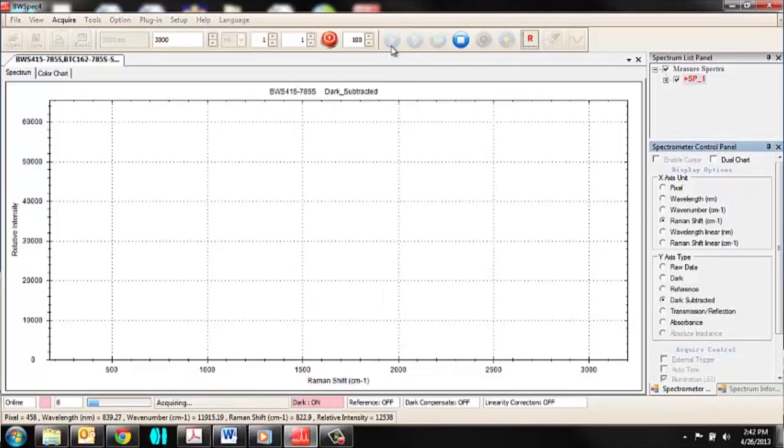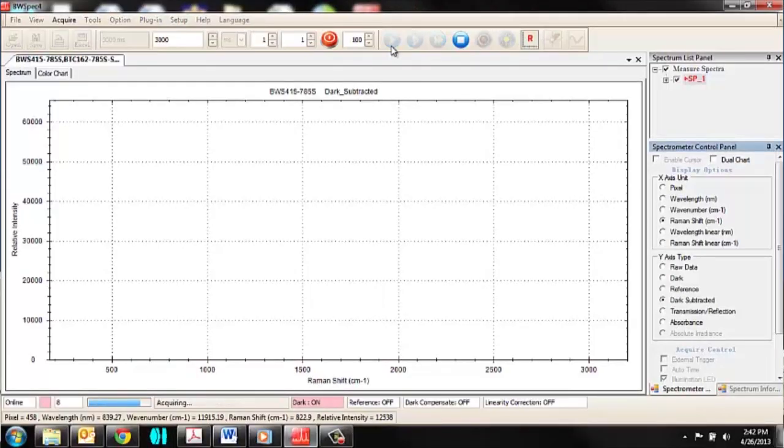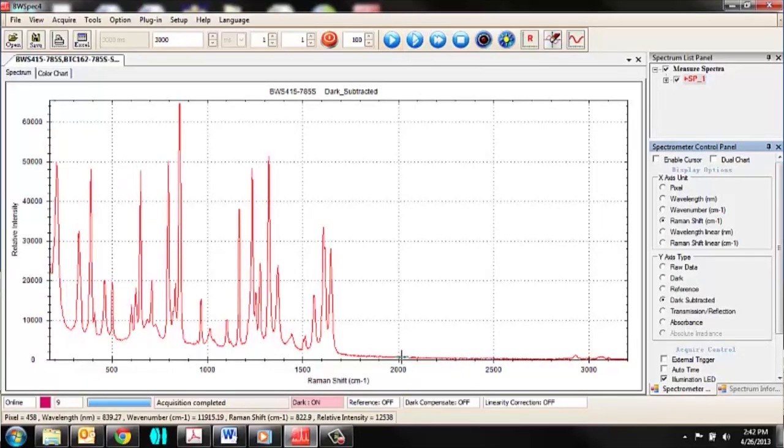So can we go ahead and take a Raman measurement of this Tylenol pill? Sure. Why don't you place the Raman probe on top of the pill and then open the shutter? If I just take a single acquisition, what you see here is the Raman spectra for acetaminophen, which is the active pharmaceutical ingredient inside that Tylenol pill. One thing I do want to point out is that the X-axis is your Raman shift, which we measure in wave numbers as opposed to absolute wavelength, in order to normalize the spectra so that they're independent of the excitation wavelength.